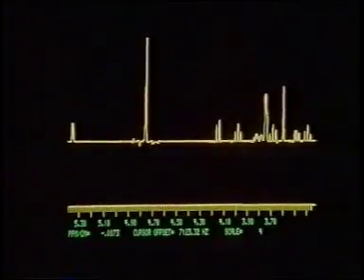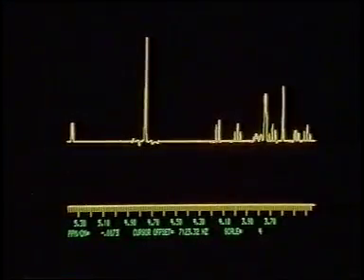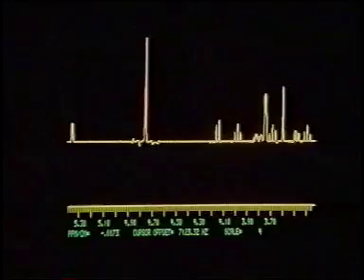Here, in the 400 MHz spectrum of sucrose, it's not obvious which set of nuclei is coupled to which other nuclei, but we can find out by single frequency spin decoupling. Let's find out if there are any signals spin coupled with this doublet on the left-hand side.